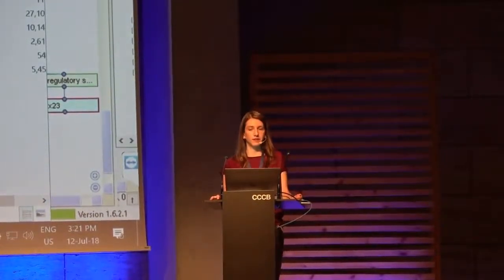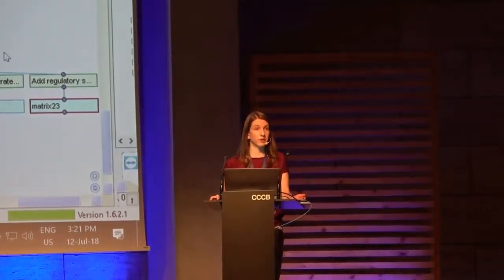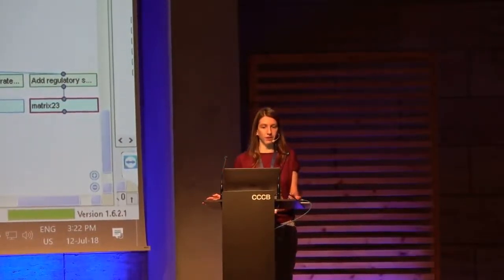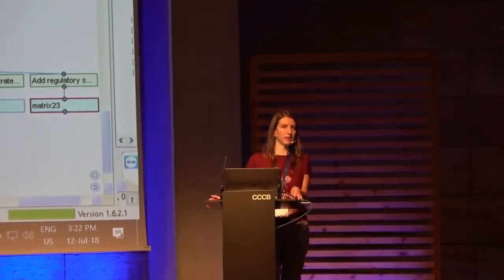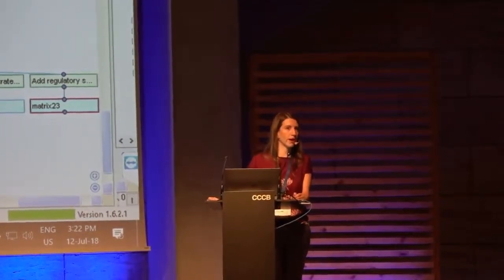For the enrichment analysis, what's the advantage of doing the clustering enrichment compared to 1D enrichment? I wouldn't say there is an advantage. You can go ahead and use both methods. And actually, it could even be more interesting to do it with the 1D enrichment, because there you don't need to define any hard thresholds, right? You don't need to define your statistically significant hits, but you can do it on the entire data continuously. So you can go ahead and do it.